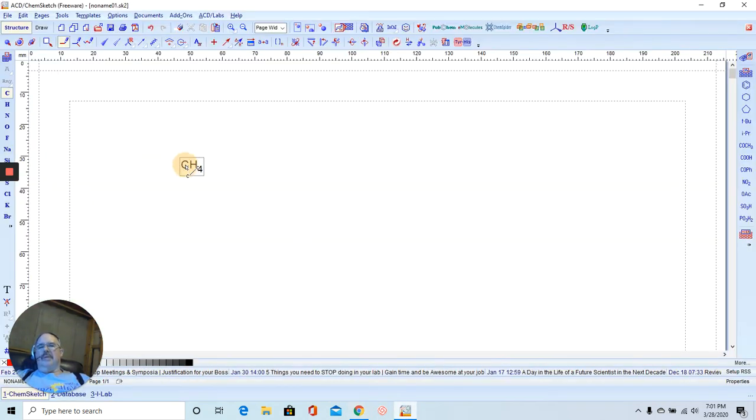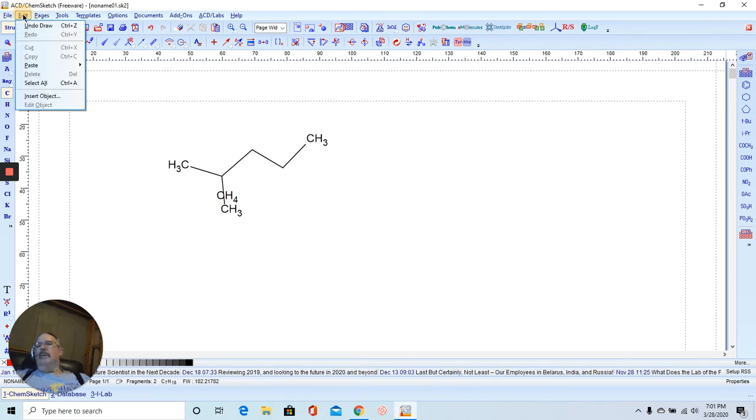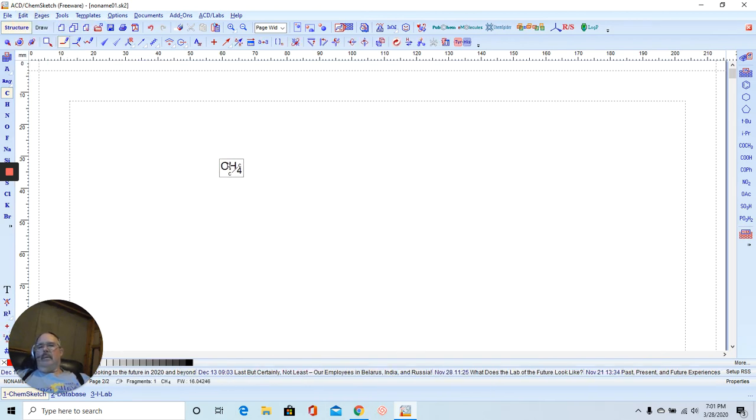All right, so this looks like 2-pentanone, or pentan-2-one.